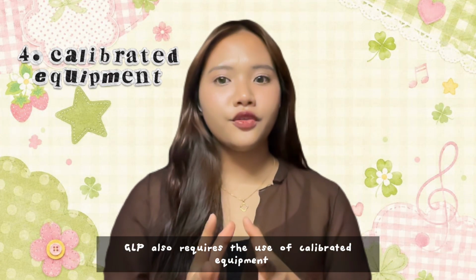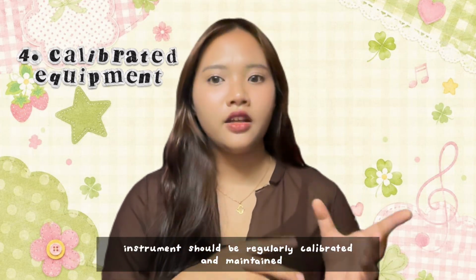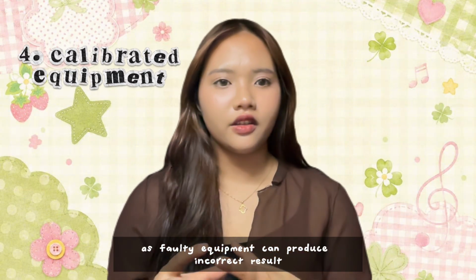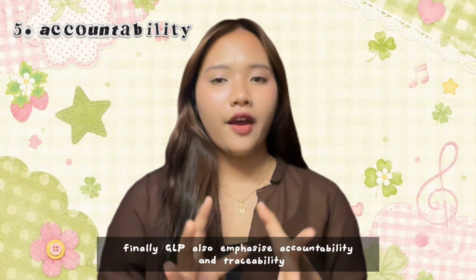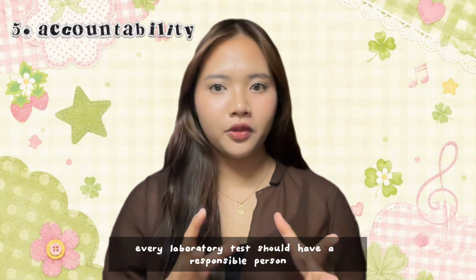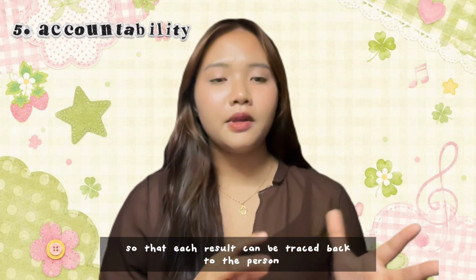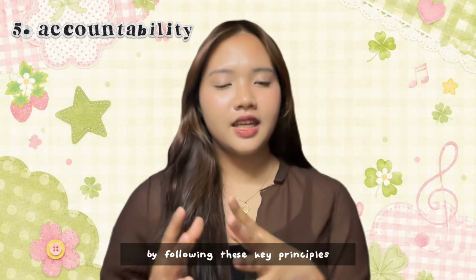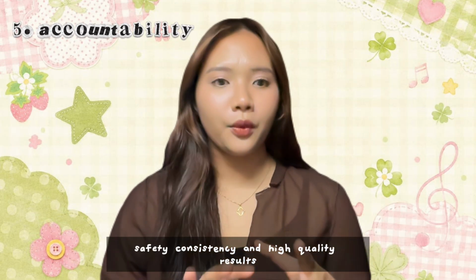GLP also requires the use of calibrated equipment. Instruments should be regularly calibrated and maintained to ensure accurate measurements, as faulty equipment can produce incorrect results. Finally, GLP also emphasizes accountability and traceability. Every laboratory test should have a responsible person, and all activities should be properly documented so that each result can be traced back to the person, equipment, and procedure used. By following these key principles, laboratories can ensure accuracy, safety, consistency, and high-quality results.